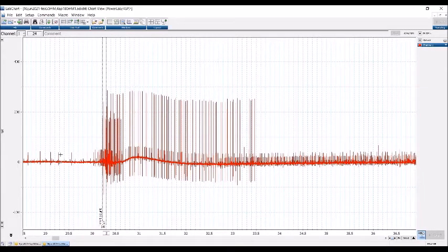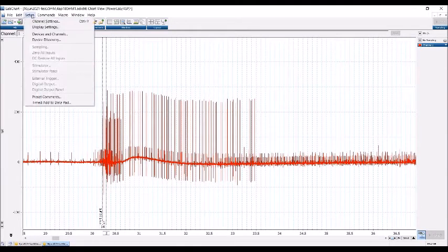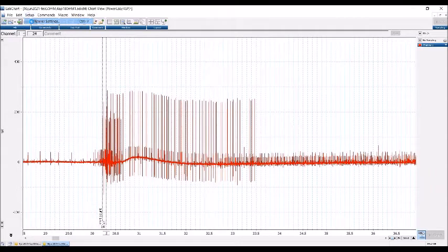So once you get your data collected and your key counter downloaded, if you so choose, you'll want to open LabChart to the file that you recorded. You'll want to find where in the file you want to count from, and then you're going to need to set up your count. So go up here at the top to setup, and then hit channel settings.